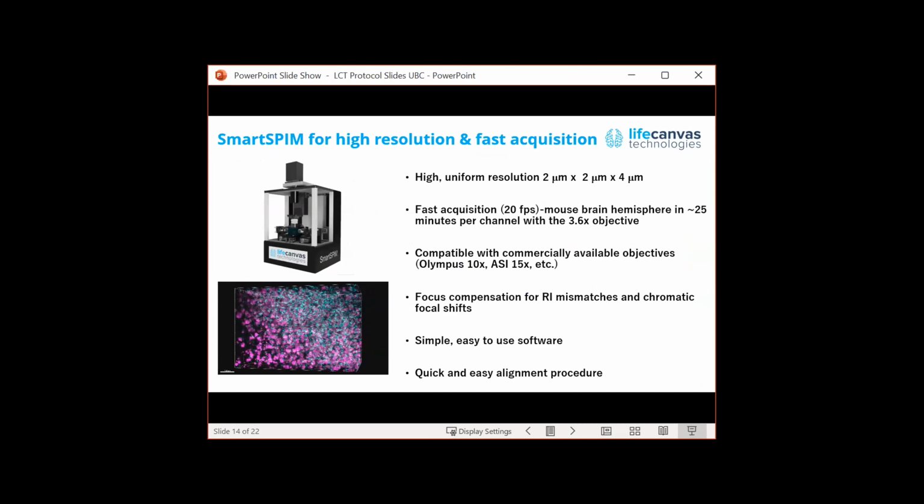And then finally, when we actually have a labeled sample or have some endogenous reporters, it comes time to imaging. So we also provide an imaging solution, the steps of which are largely similar in terms of protocol to any light sheet microscope. You would mount your sample in an agarose gel that is also index matched, and place it inside the microscope where it scans.